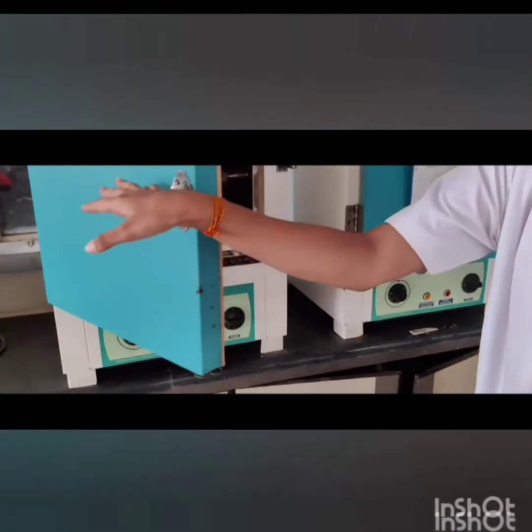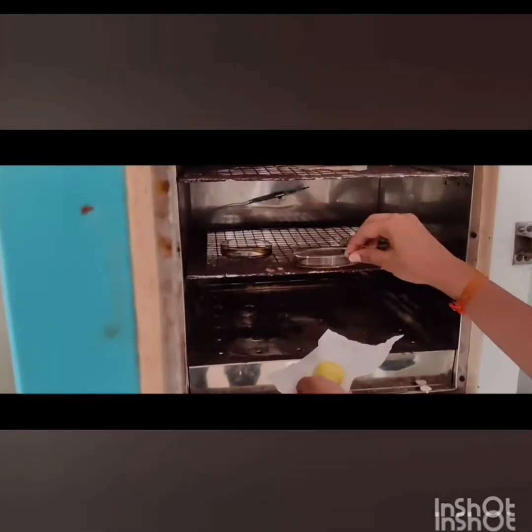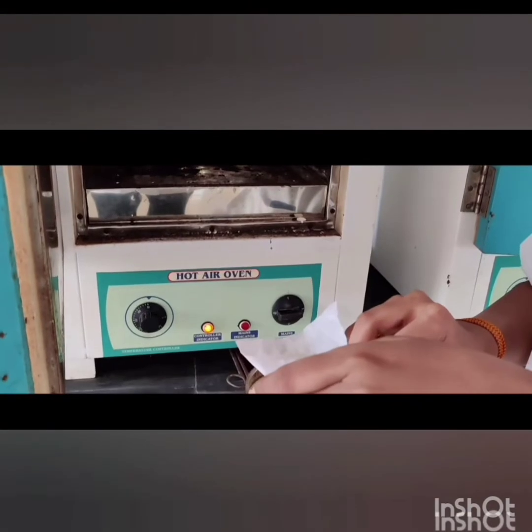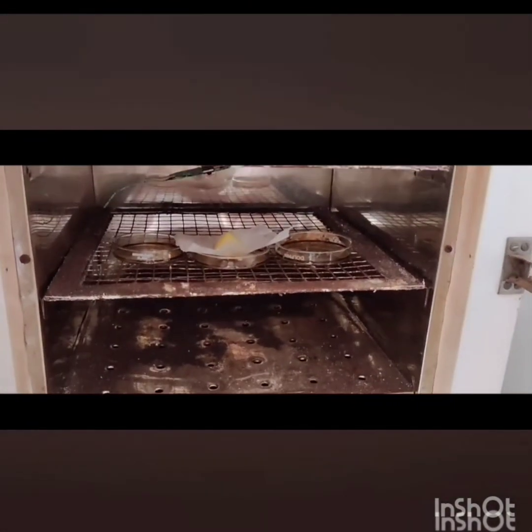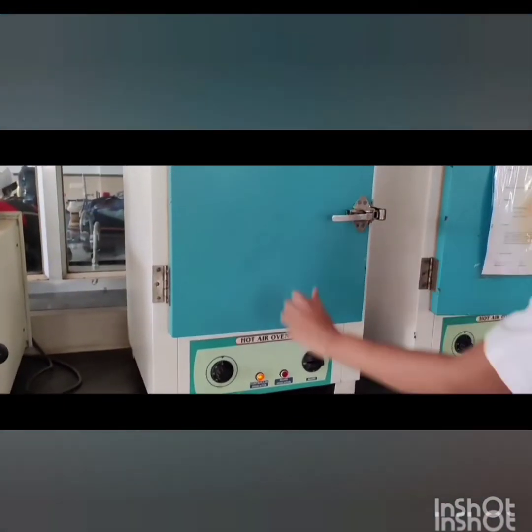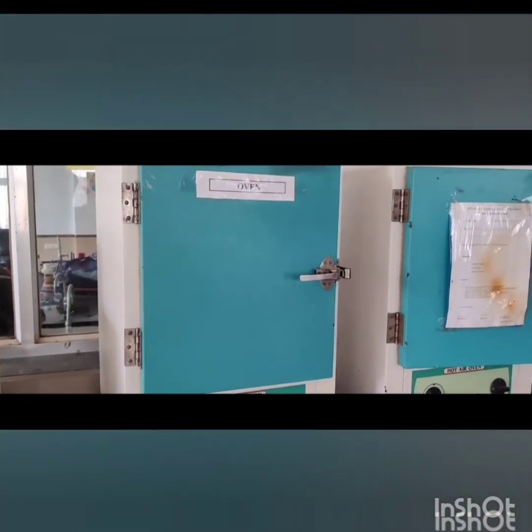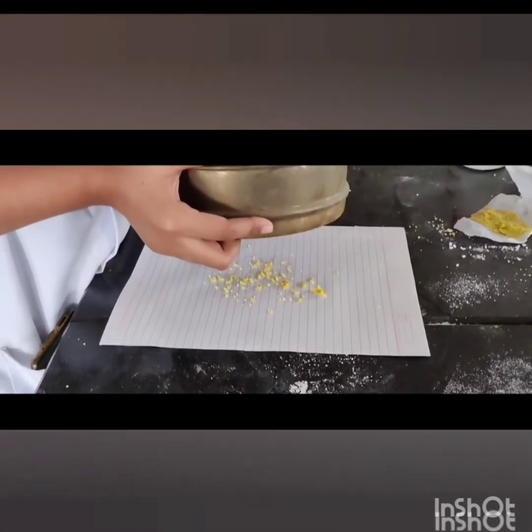Then we have to place this dough in an oven at 40 degrees Celsius to remove the isopropyl alcohol. Then again we have to pass that dough through a mesh.